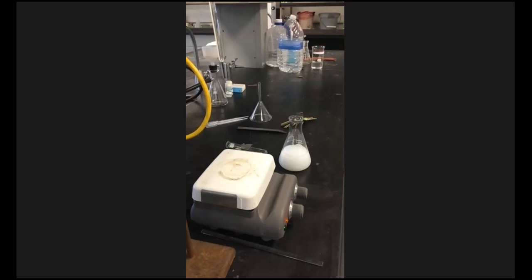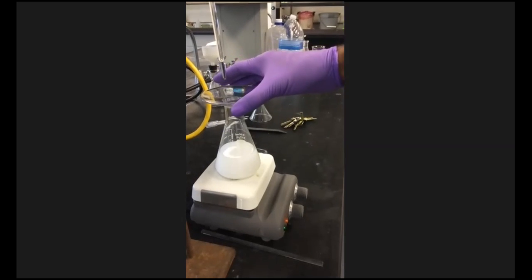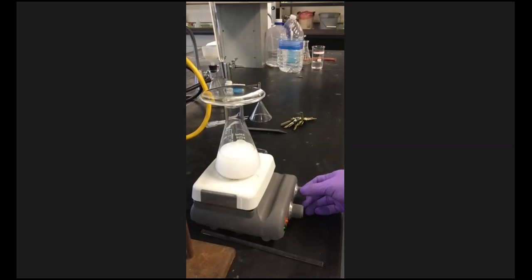They do make hot plates that have aluminum surfaces, but they're not very sturdy. They're not reliable. They have hot spots on them. This is very evenly heated. All right, so I'm gonna put this on here, and it says 15 minutes. So go ahead and start the timer, and I'm gonna check the temperature after 3 minutes. Let me know when 3 minutes pass. I'm gonna check the temperature.